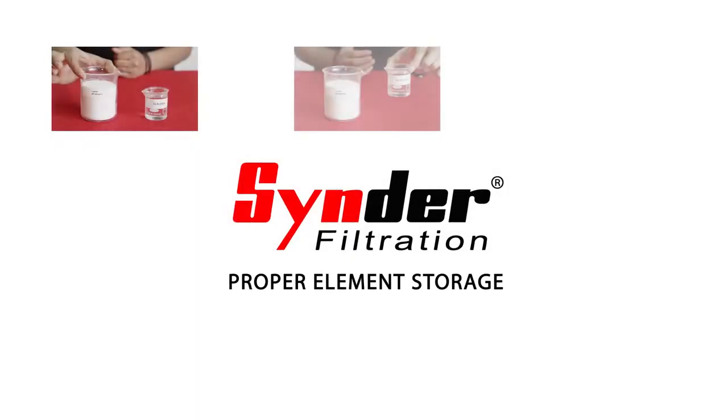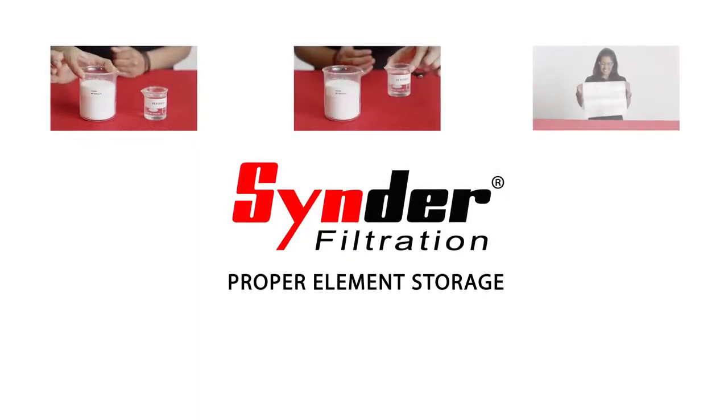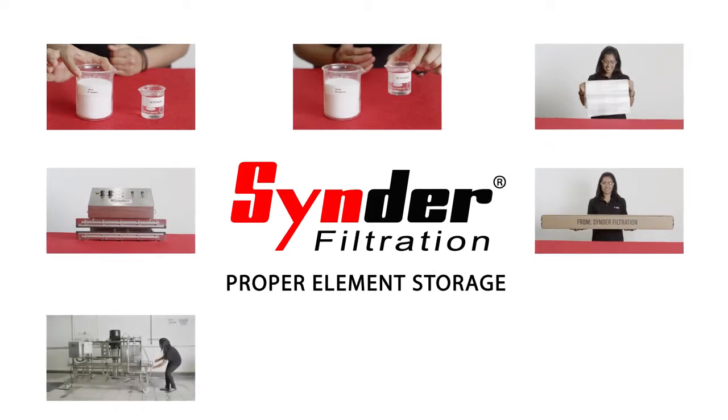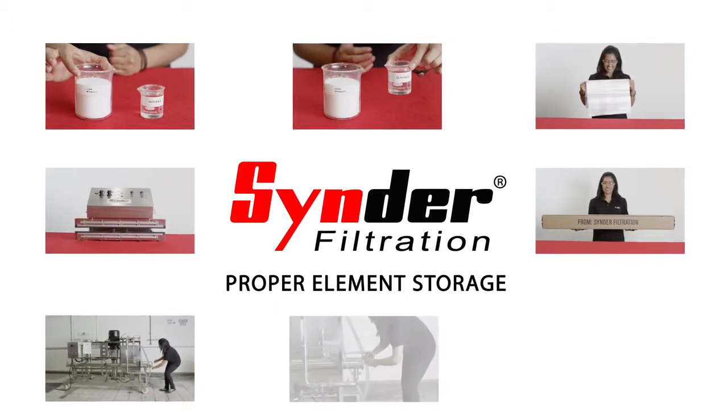Proper storage can eliminate the concern of bacterial growth on membranes, which can cause irreversible damage and void the warranty. In this tutorial, we'll show you the proper procedure to store the filters for an extended period of time.